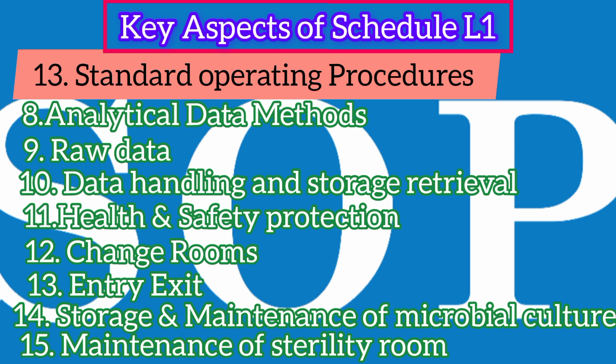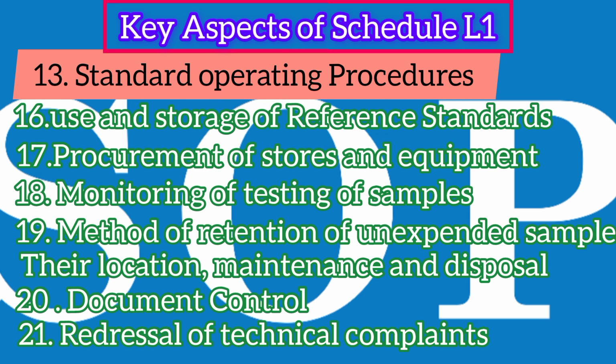11. Health and safety protection. 12. Change rooms. 13. Entry-exit. 14. Storage and maintenance of microbial culture. 15. Maintenance of sterility room. 16. Use and storage of reference standards. 17. Procurement of stores and equipment. 18. Monitoring of testing of samples. 19. Method of retention of unexpended samples, their location, maintenance and disposal.